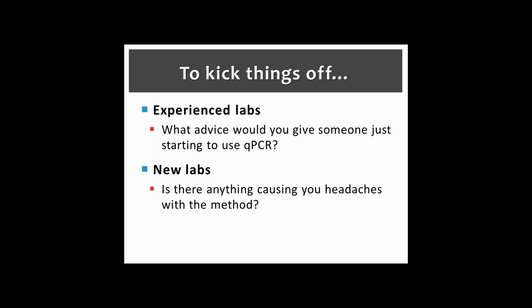The method is actually not going to detect one E. coli per sample. So the way we've approached it is, because we see this from a lot of labs, ourselves included, that will get some weak signal from a negative control. We're not concerned about it if it's below our limit of quantification, and that eliminates a lot of problems in that regard. And if you think about it, I think it makes sense because that limit of quantification is well below whatever your criteria are ultimately going to be. So if you've got a little bit of signal, are we really concerned about it?